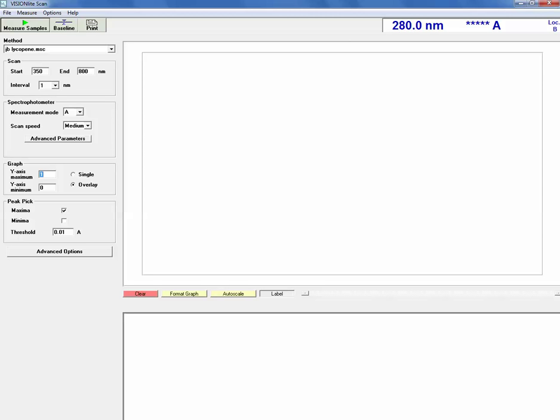If you can't get an absorbance, then you can't get data to do your calibration curve and to do your sample preparation with. So you want to make sure that this is checked. If this is not checked, and you scan a sample, you will see it pop up on the screen, but you will see no data associated with it. And you can't go back and fix it, which means that you have to rerun that sample. And you have to make sure that this box is checked before you go further.